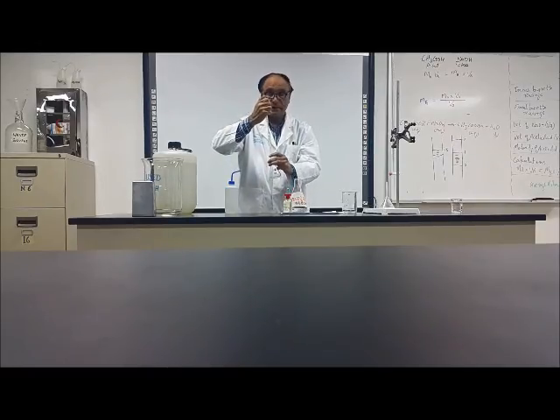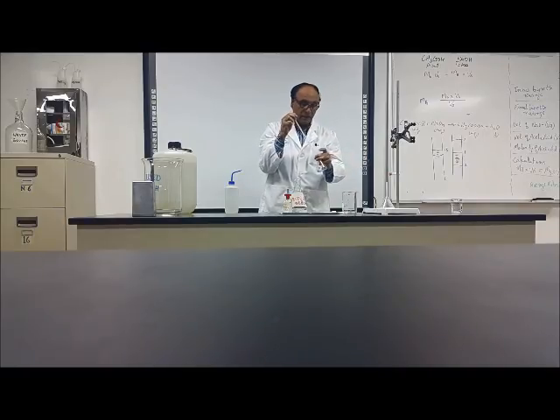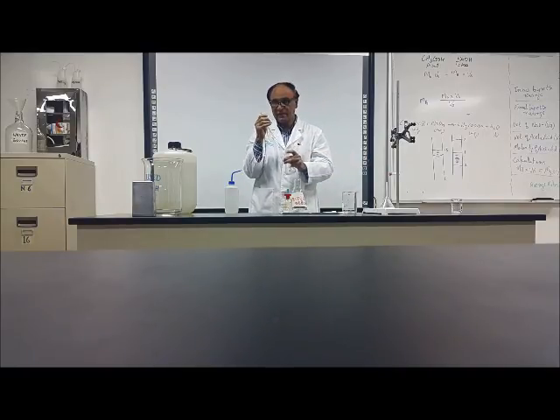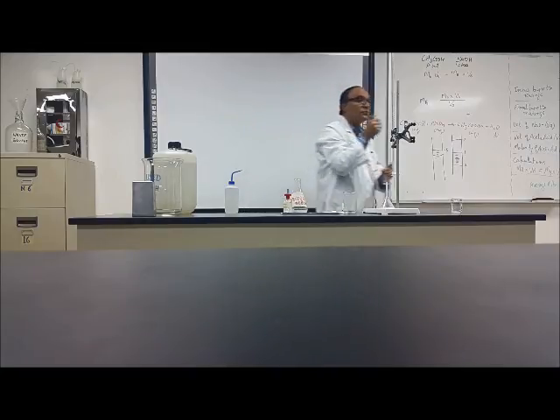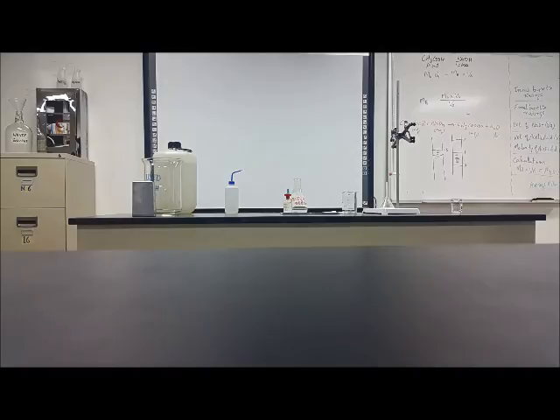Make sure you have the flask with you. I know some students are careless. They will hold it here and they will come to your seat. From there they will come here and they will look, where is my flask? Where is my flask? No, it's not there. The flask should be with you, the washed flask.